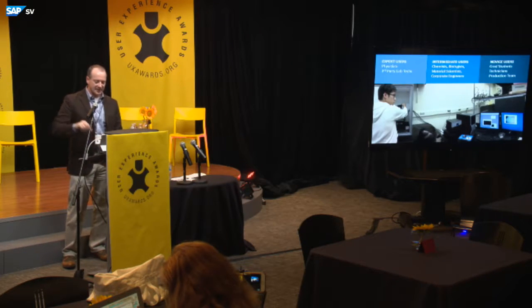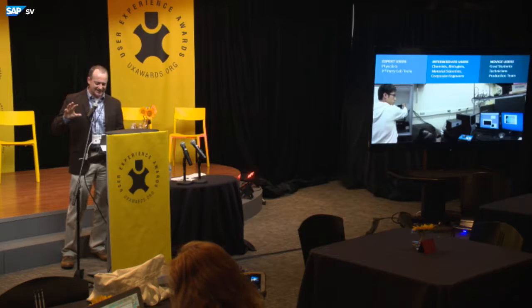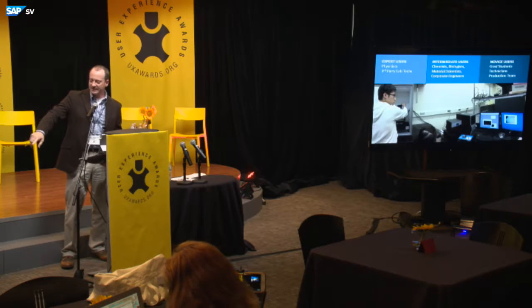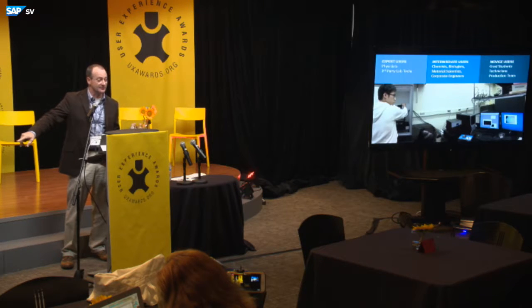Once we understood the mechanics of how you use this, had some sense of the user workflows, their mental models, and had some notion of the physical environment. You'll notice here that this professor is twiddling knobs on the actual device, watching the results of those changes reflected in the software from like 6 to 8 feet away.